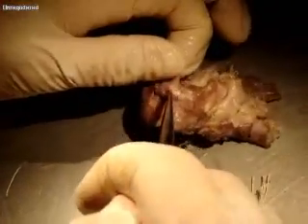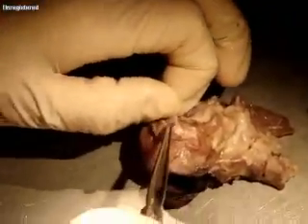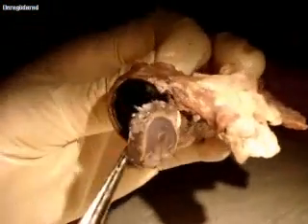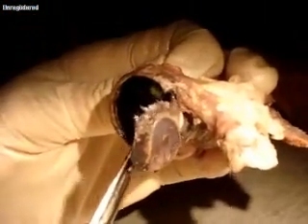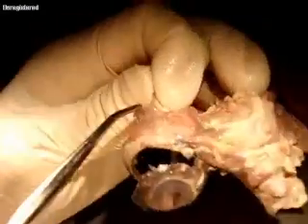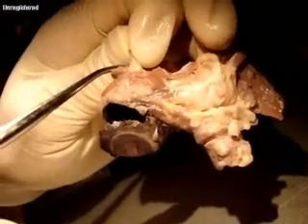And so it's called the blind spot because there are no cones or rods at that spot. Okay? So there's nothing there. The actual, it asks you for the macula lutea. You know, you guys, I just don't know how you would see the macula lutea, but it's straight back. It's the visual axis of the eye directly going back, but it's definitely not where the blind spot is. It's above it. Okay?